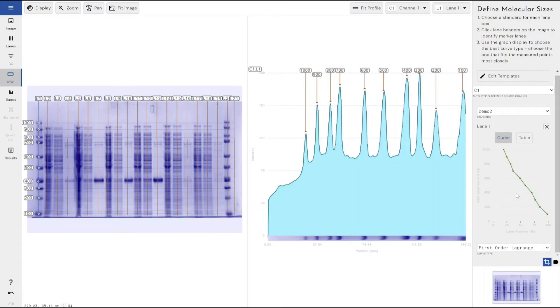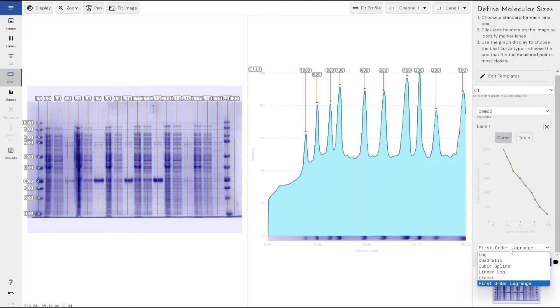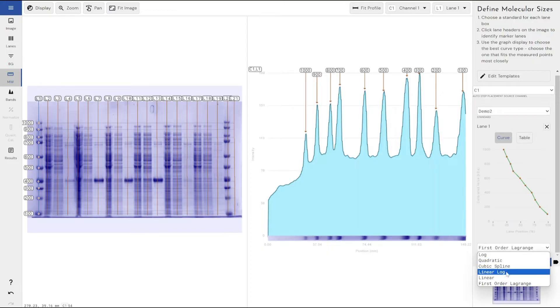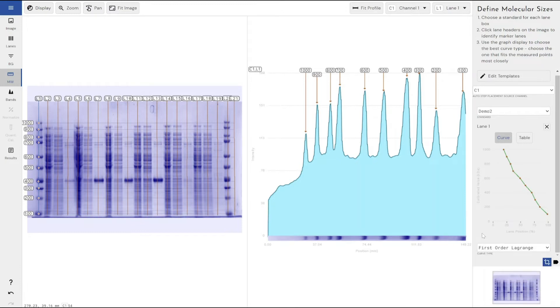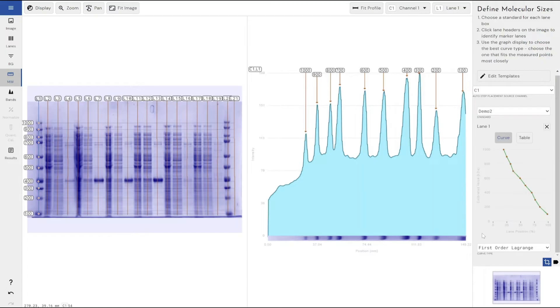Within our software you do have the ability to use different lines of best fit depending on the molecular weight ladder that you've used. Say if you've used a quadratic or a log ladder instead of a linear one, which is the one that I've designed here, the fake one that I've designed is very linear. You do have the option to change between those, and we do support those, and then obviously your unknown bands, your sample bands, will be extrapolated according to that mathematical function rather than assuming a linear function.